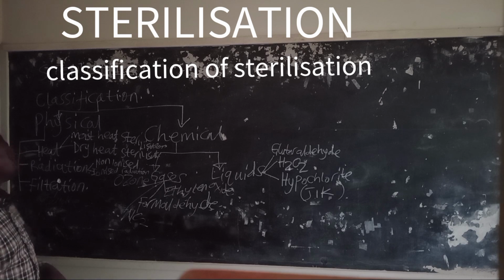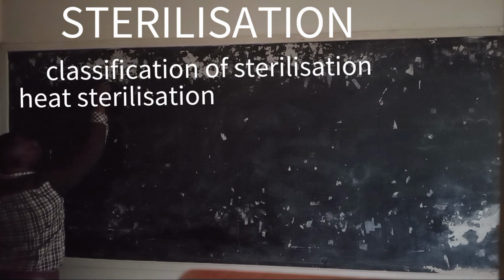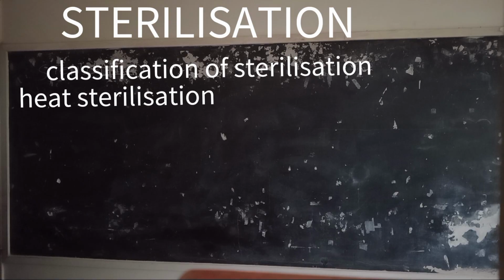So let us try to pick one for today. We talk about it briefly, then we continue in details. Heat sterilization. When you look at heat sterilization, we saw that we have moist heat and dry heat sterilization.